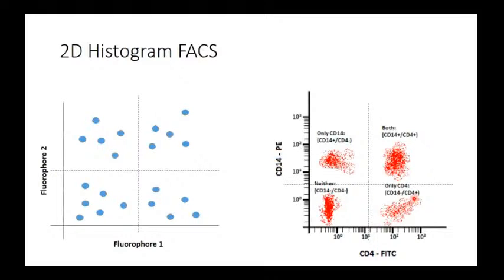As you know, in the new FACS machines, we can analyze tens of proteins and tens of cells at one time. There is now one FACS machine on the market which contains 10 lasers and 30 detectors. Can you imagine 10 lasers and 30 detectors? So you can analyze many proteins and many cells at one time. But of course, the data then will be much more complex than this data. This is a very simple data.